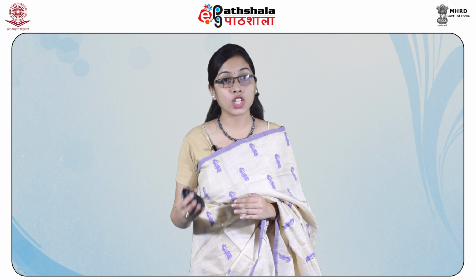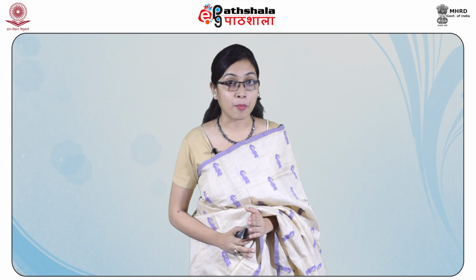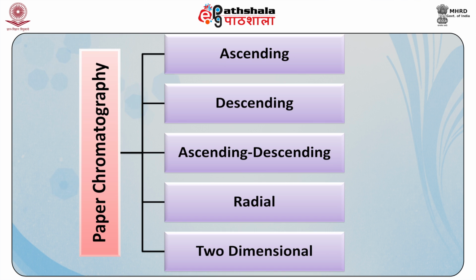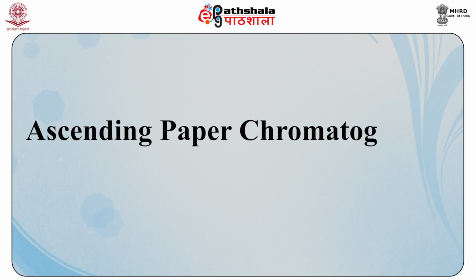After preparing the chamber and spotting the samples, the paper is ready for development. Depending upon the type of development, paper chromatography can be classified in several forms such as ascending paper chromatography, descending paper chromatography, ascending-descending paper chromatography, radial chromatography and two-dimensional paper chromatography. Now, let us take one by one each of these. First is ascending paper chromatography.